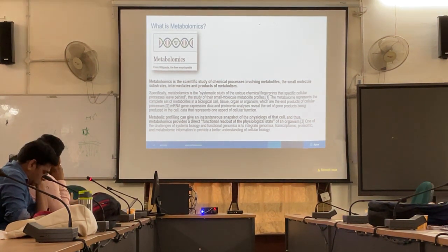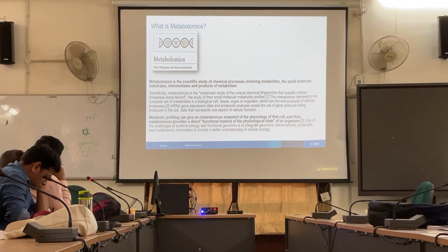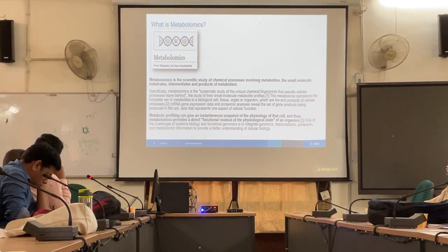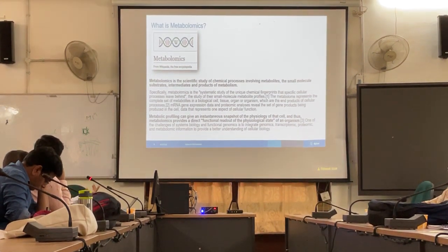So with a large number of compounds, how do you present that data set, how do you show it? That is the reason all the tools which we use for metabolomics are already used for omics. Some of you have done MSc recently, or maybe when I did MSc in 2002, at that time we used to learn about all these techniques, and those omics tools are applied to metabolomics also.